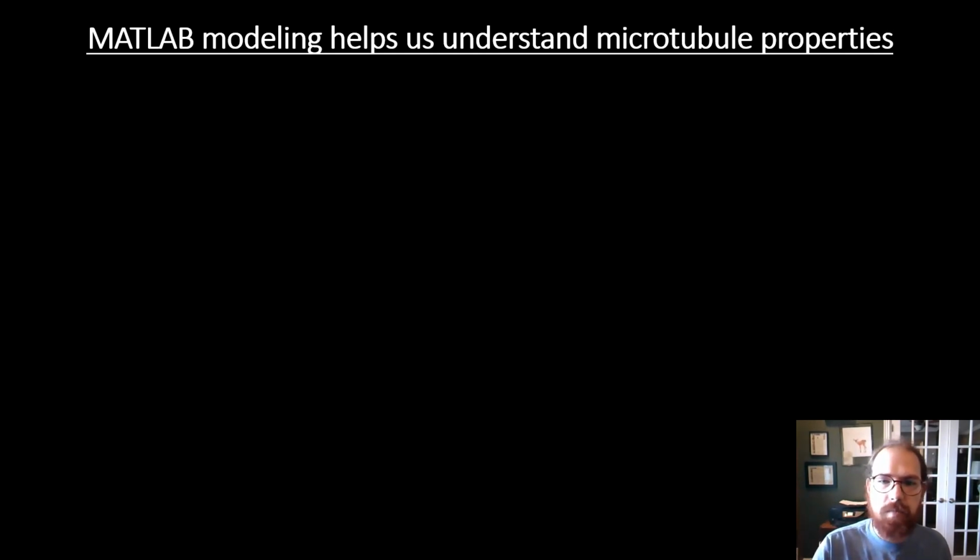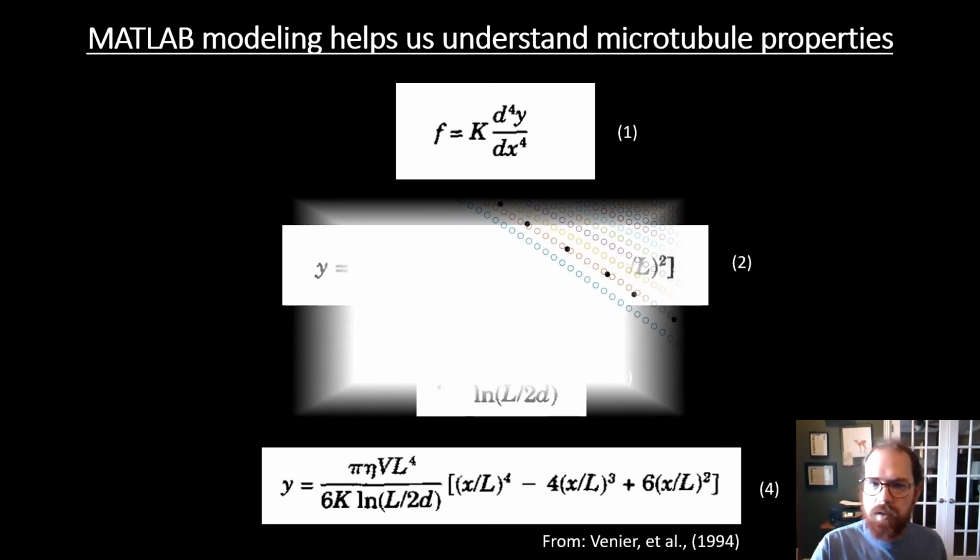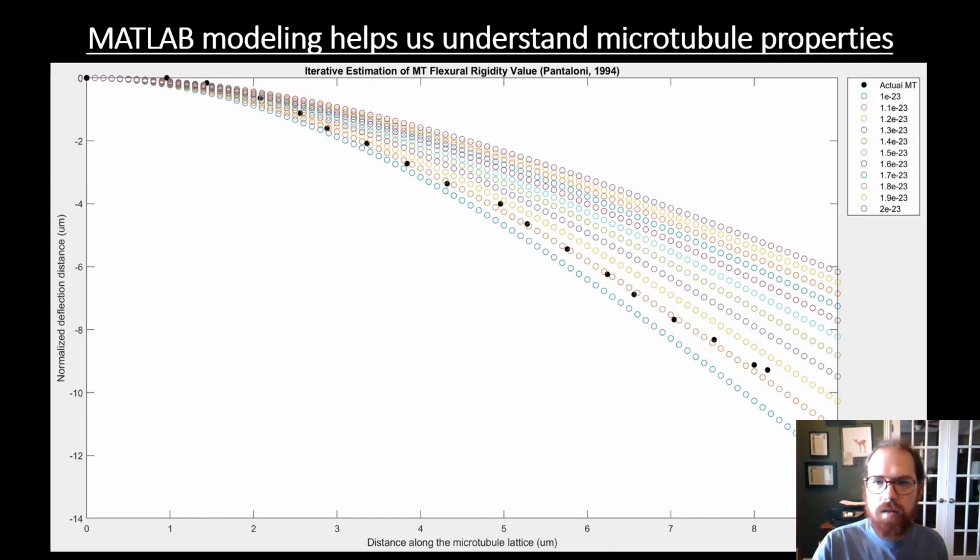One of these techniques is Matlab modeling. We can take these differential equations that describe microtubule mechanics, plug them into Matlab, and we can see that the predictions made by the Matlab model are pretty well in line with the actual microtubule results that we see when running these experiments.